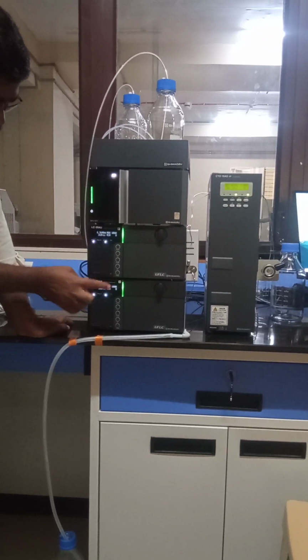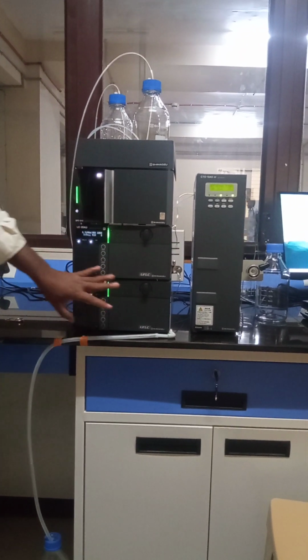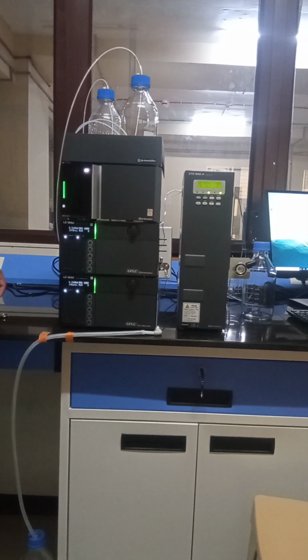See, pump A and B. Now press. Now it is going on. Okay, up to this level is sufficient for the hardware. After a few minutes, you can write down the next line.